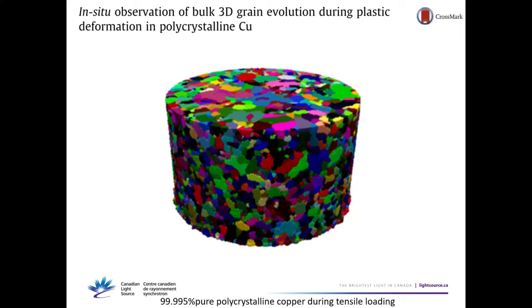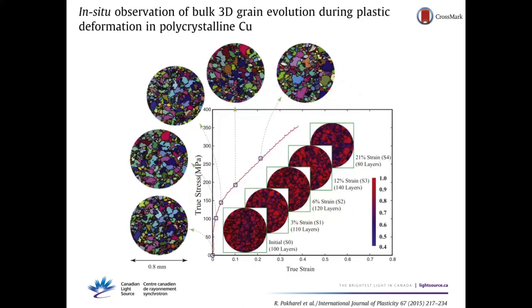And if you do this 3D grain mapping during the mechanical testing, then you can see how any particular grain evolves while you are loading, how it might change, it might reorient, it might grow, or you might see a crack growing. So being able to do 3D grain mapping during mechanical testing has an extra appeal. So I'm done now with the examples of in situ mechanical testing.